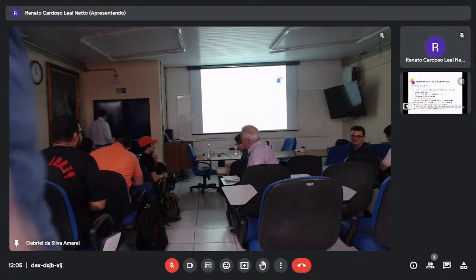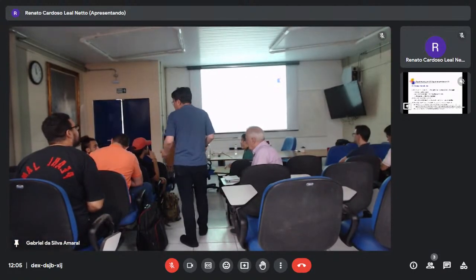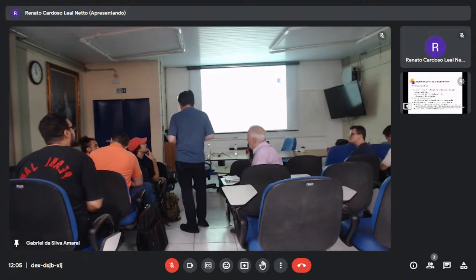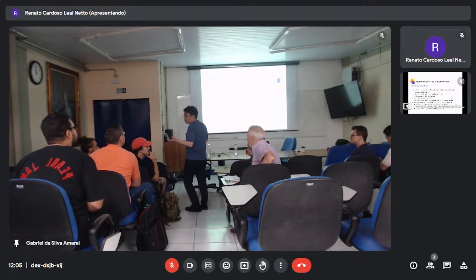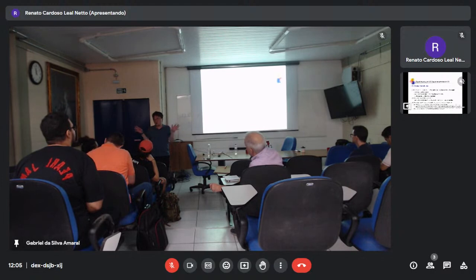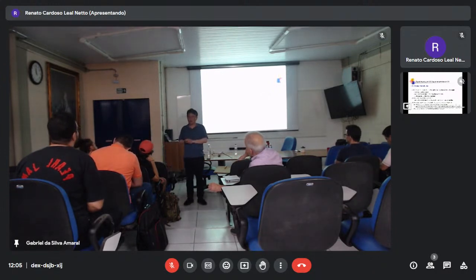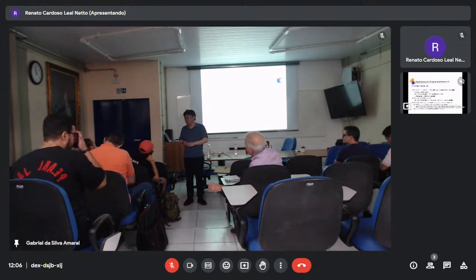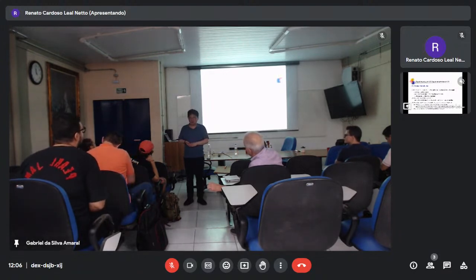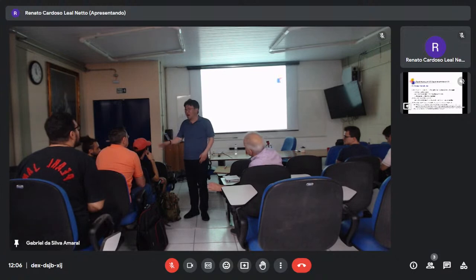So she mentioned it. I said no normalization method is simply better or not. But usually, as long as you added the internal standard, you can use it and the data is better. But always my first choice is total intensity, because a fingerprinting way is possible. But sometimes another normalization method is useful, for example using one of the signals as the reference. Here some signal, alanine, comes out. I'm not interested in that; I'm interested in compounds compared to alanine.